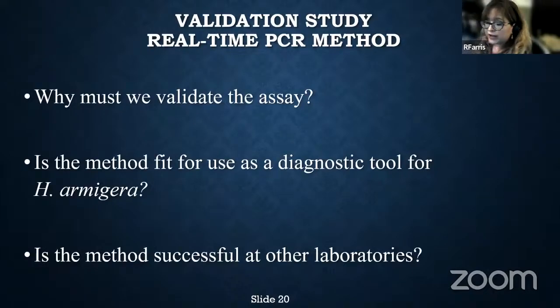I know I have to hurry here a little bit, but I want to talk to you all a little bit about why we validate and the importance of validating these assays. Especially assays such as these, which might be applied in other laboratories or in the outside world, we have to validate. One of the reasons is we need to make sure that the tool that we've developed is fit for use as a diagnostic tool for the said species, in this case, armigera. And is this method successful at other laboratories? Because that in itself is extremely important.